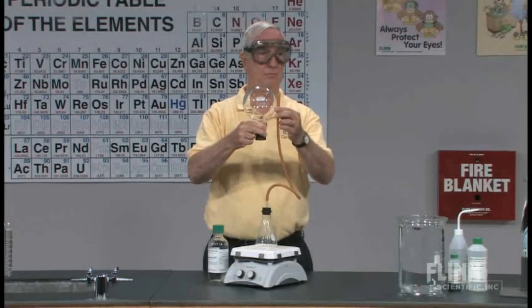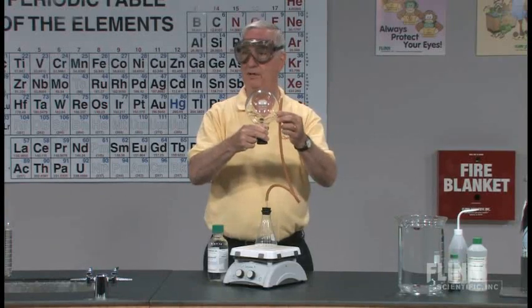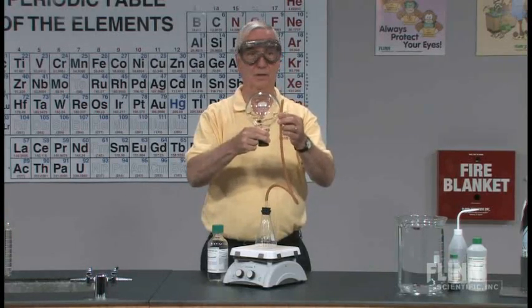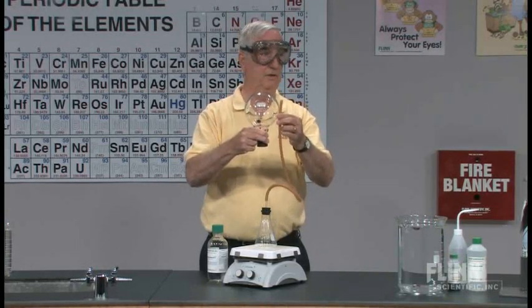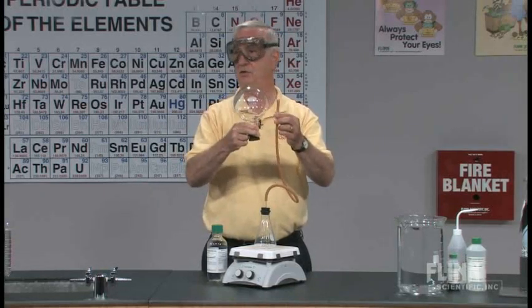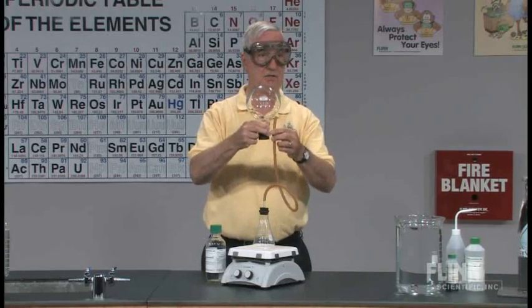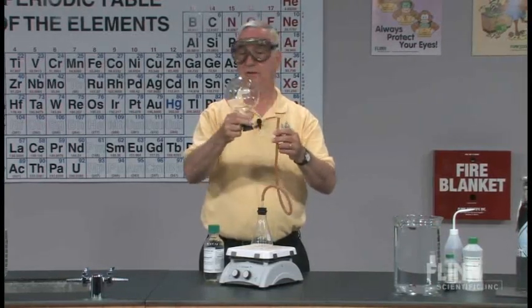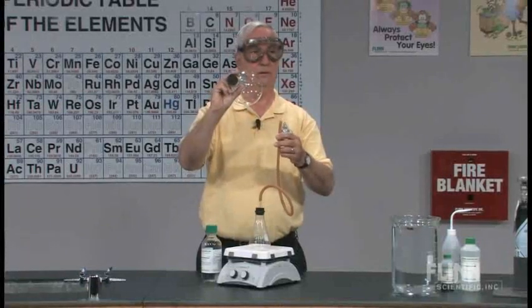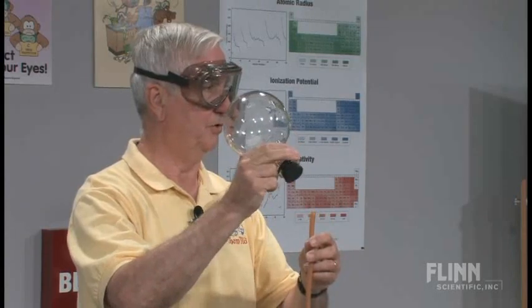The problem is we never know when the ammonia flask is filled. So the rule here is to overdo it — collect more gas than you really think you might need, because you want to be certain that the flask is filled. Once you feel it's filled, make sure you have a solid stopper ready to stopper your flask to contain the gas.